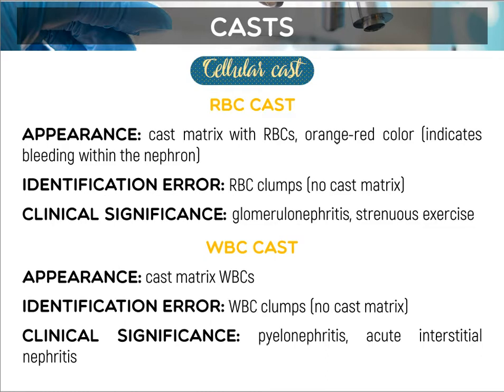And then lastly, we have your acute interstitial nephritis. So this is usually drug related ni siya, allergic reactions, guys. So kani we have your WBC cast pero wala siya bacteria. And mao na siya: WBCs, cast, and your bacteria.